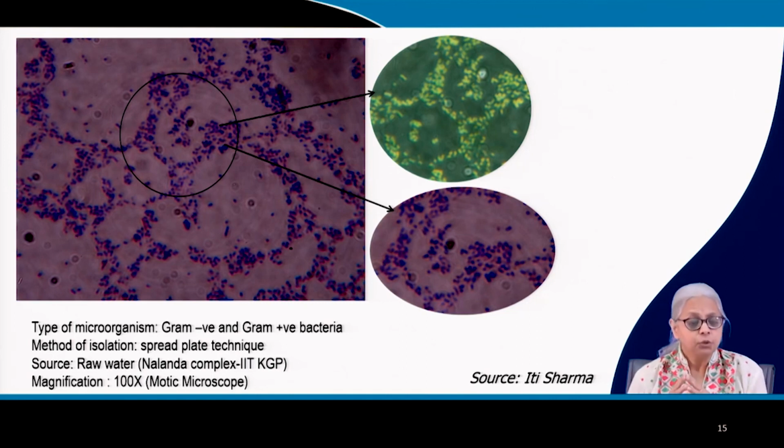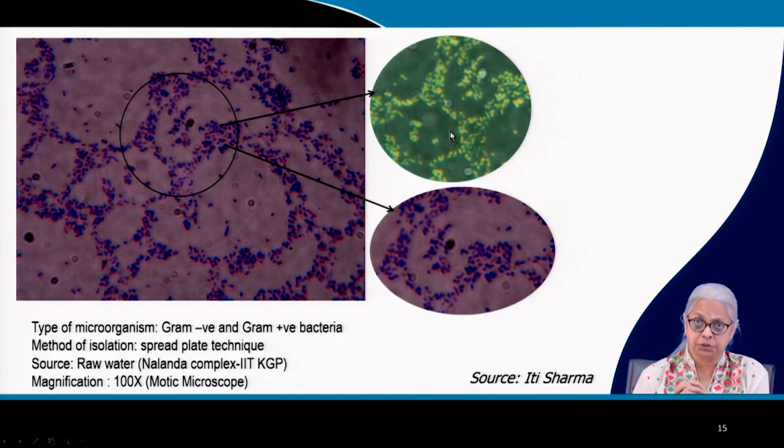I would say no one would probably want to count the pink cells. They are there, but they are hard to see. Through the filter, in the fluorescence option, you can see the different colors. So you have green and orange cells, and they're much easier to distinguish.